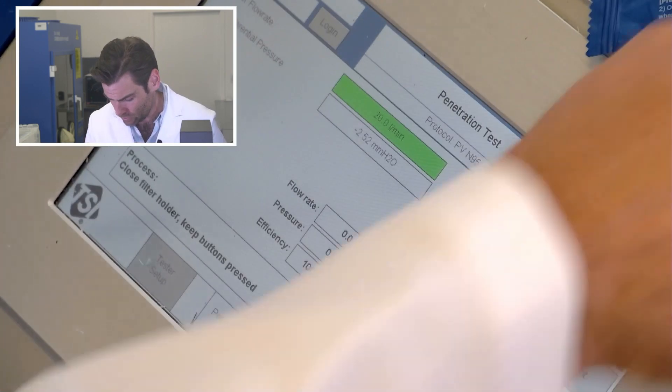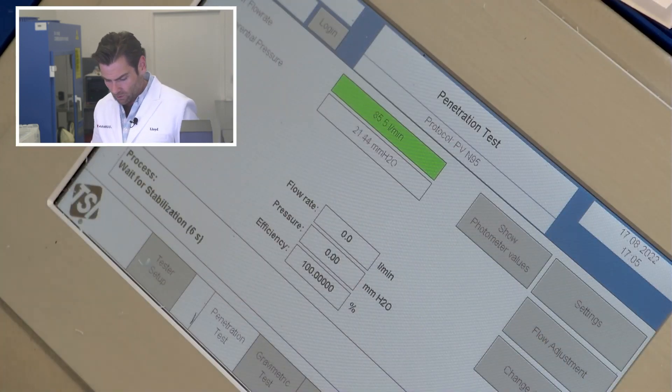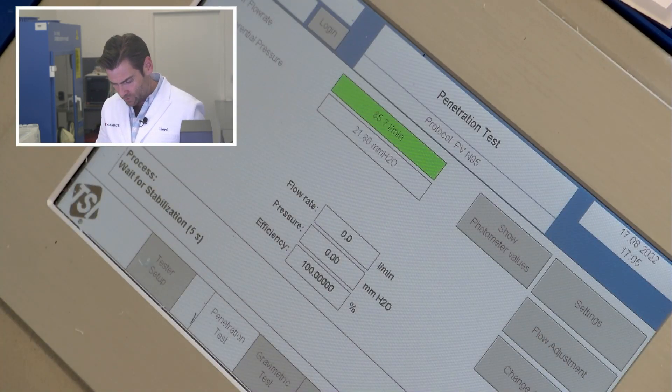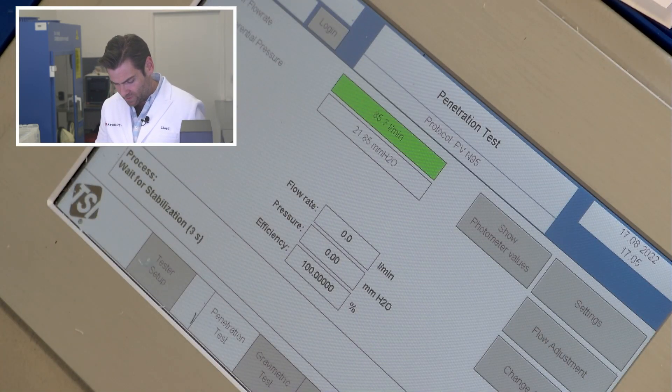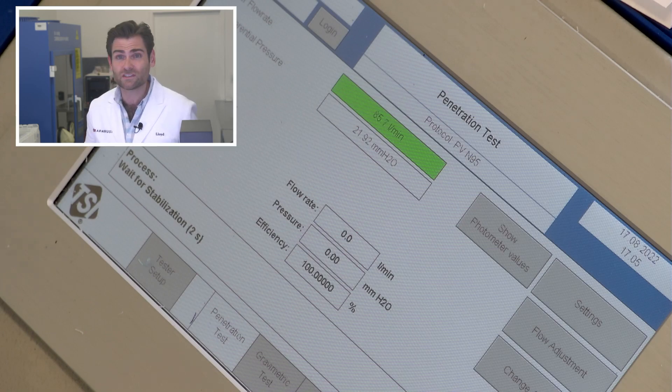All right, this is a PFE machine, particulate filtration efficiency machine. We're doing the N95 test here. Interestingly on the packaging it claims - on the mask it claims type 2r which I believe is 98% filtration using that machine we have right there. This one's a little bit more aggressive test however.